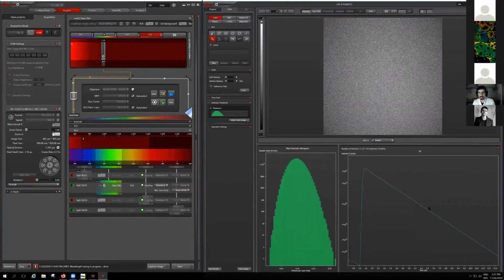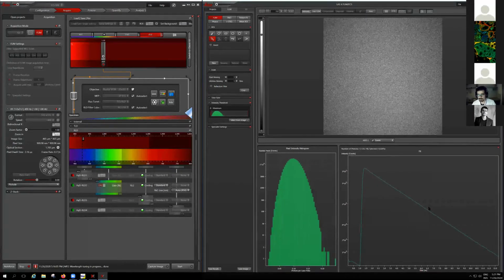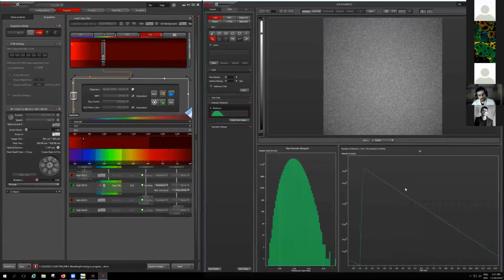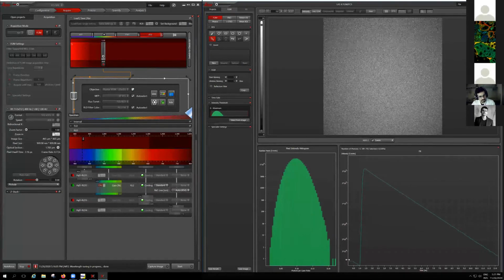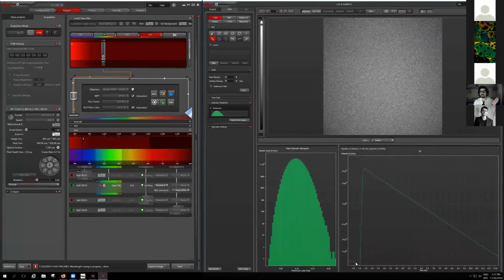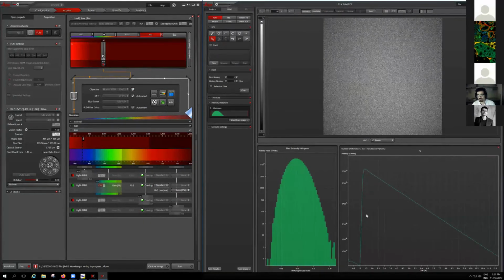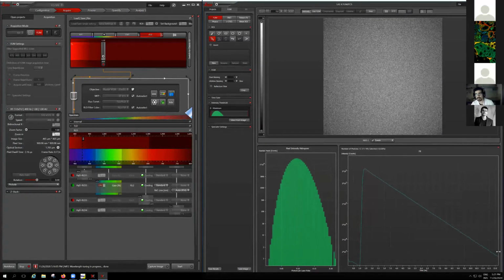What is the lifetime of the dye that I'm using? Nominally, it's 3.6 nanosecond. 12.5 nanosecond between 2 pulses is not enough to completely record the whole decay of this dye. That's why we see the end of the decay curve actually showing up in the beginning of the decay. It's like it's sending it to the next pulse. But anyhow, we have algorithms that can fit this residual from the incomplete decay curve that we are measuring.